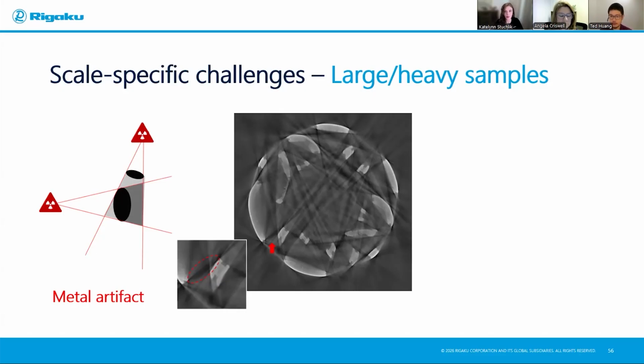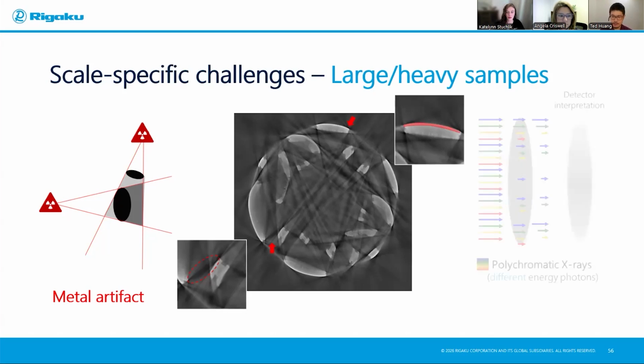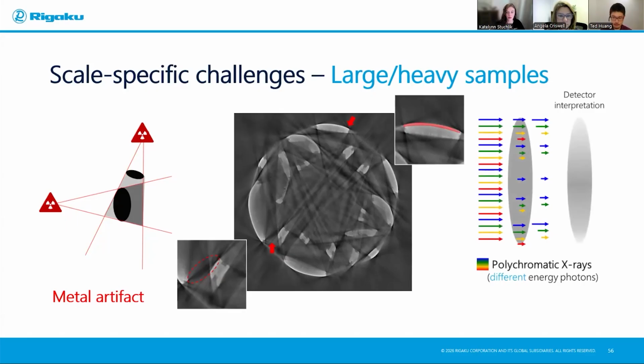Now we have also other stuff, like here, there's a light glow on the top of this portion that actually doesn't exist. It's another artifact or a distortion caused by something called beam hardening. I'm not going to delve too deep into this. In fact, these are topics of their own, specifically about high attenuation things and what you can do to fix it. Actually, in fact, we already did.